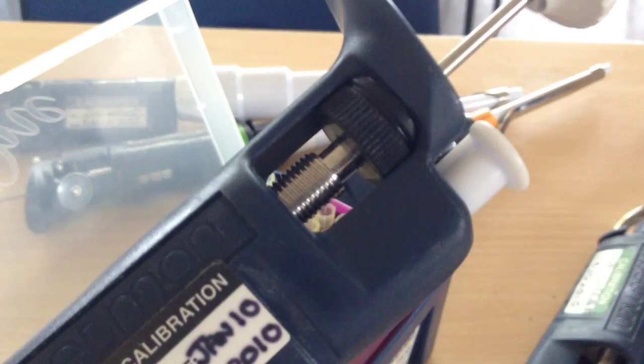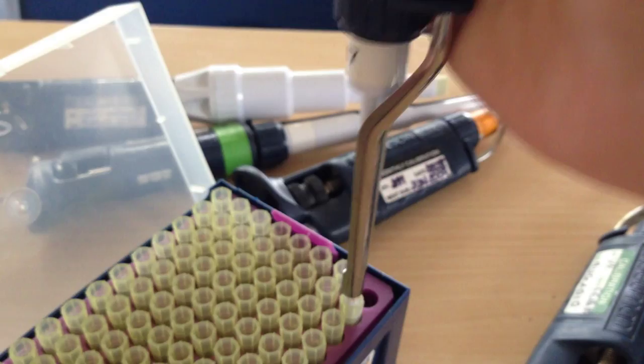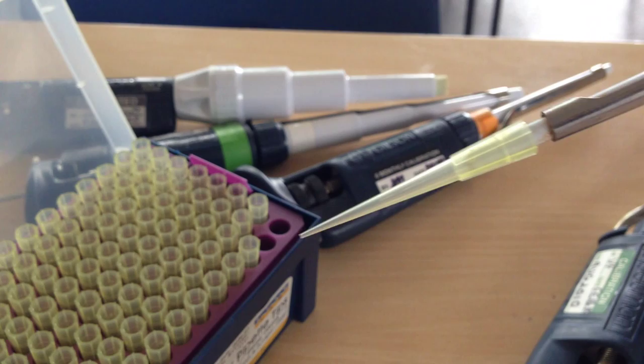Now to get the tip off is this bit here. That's the bit that you need to press to get the tip off. So you press it. This bit will come down and the tip will pop off like that.